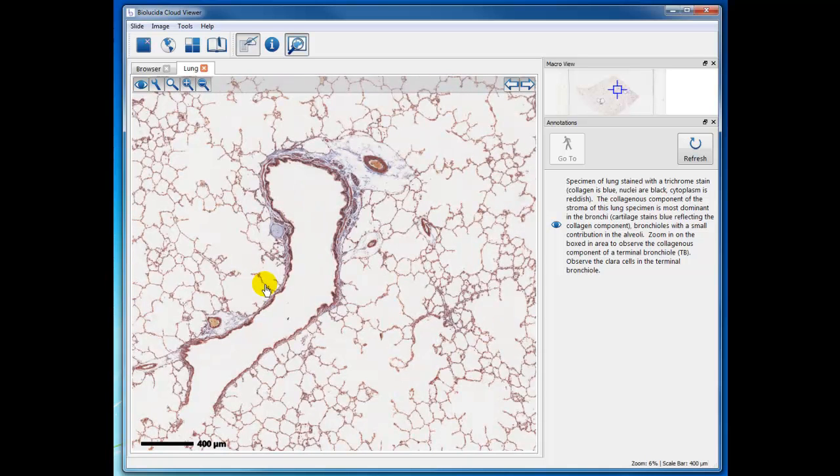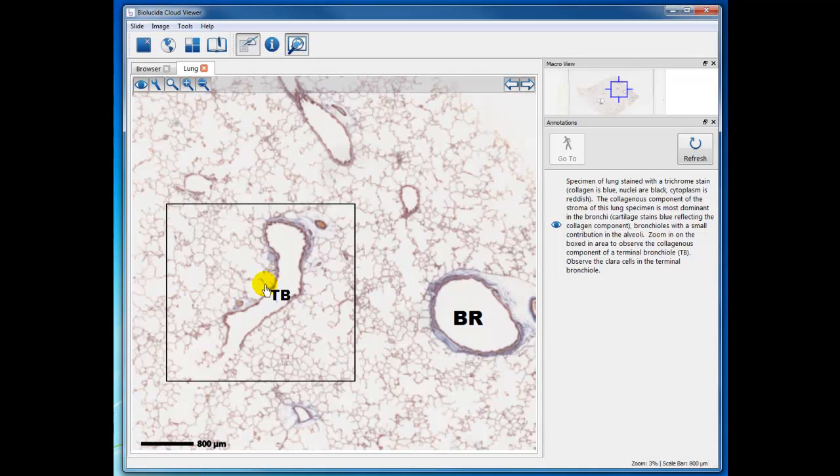Okay, now let's stop this video, and then I will use a separate video to do the reticular fiber specimen and the elastic fiber specimen.